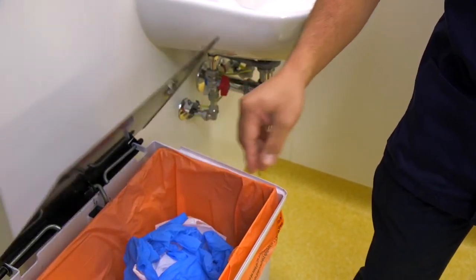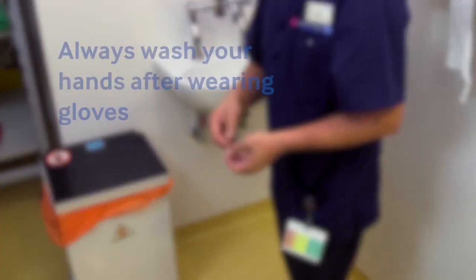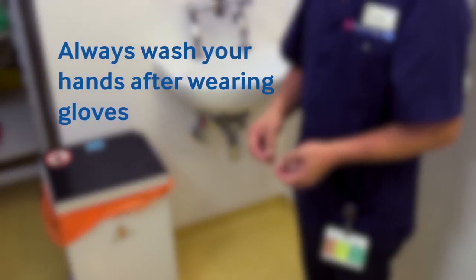Always wash hands after you've finished using gloves.